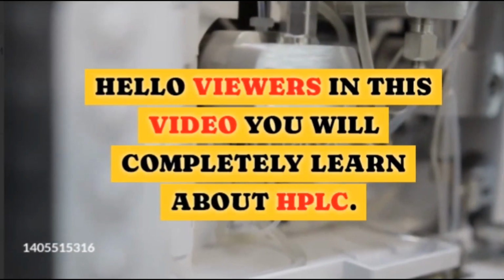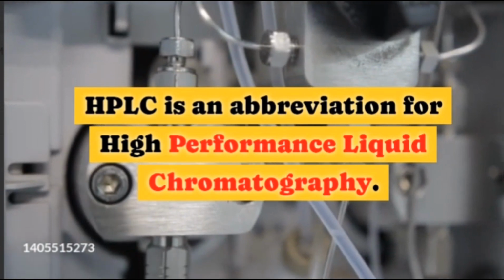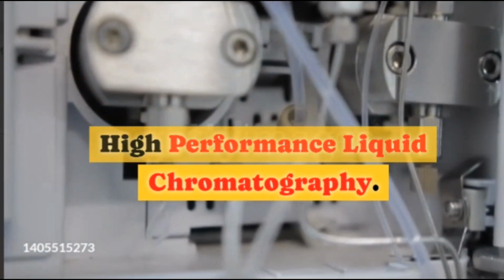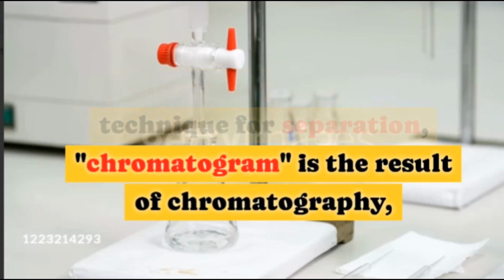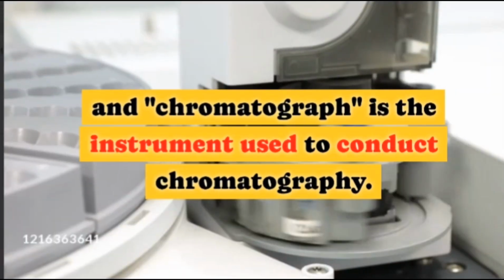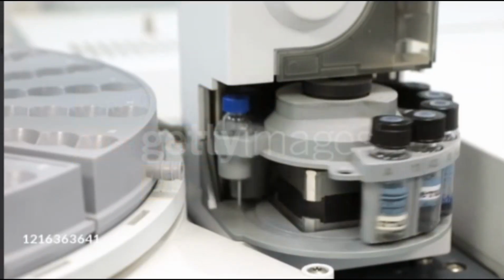Hello viewers, in this video you will completely learn about HPLC. HPLC is an abbreviation for High Performance Liquid Chromatography. Chromatography is a technique for separation. Chromatogram is the result of chromatography. And chromatograph is the instrument used to conduct chromatography.